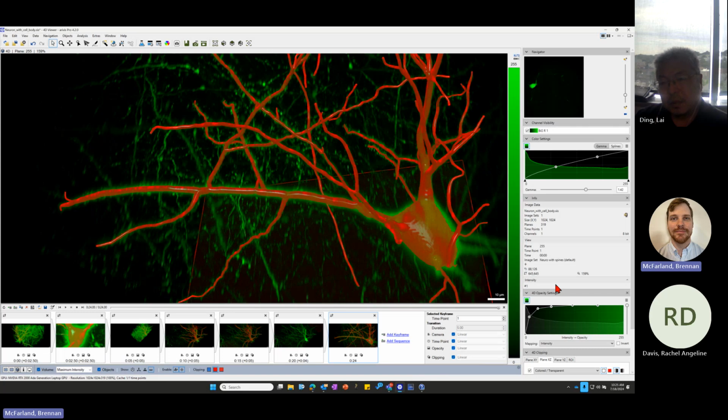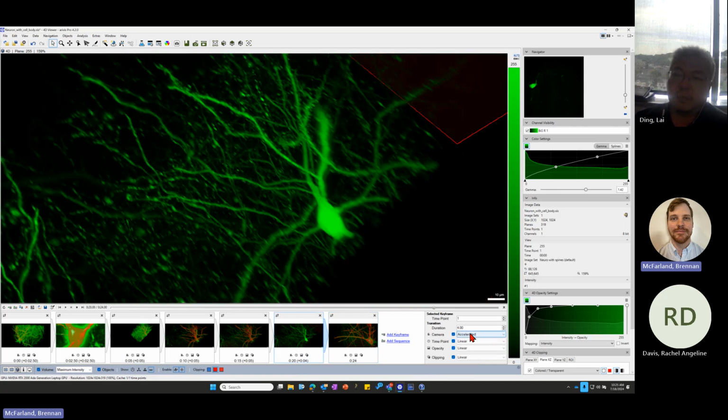It's still going to move through that. The sequence is the same. It's just how fast you want to move through the sequences at different parts of it. So even though the whole frame is going to be 4 seconds, it's just saying, where do you want to emphasize the transition? Do you want to accelerate it at some point in this 4 seconds, decelerate at some point, do both, or just hold it linear throughout the 4 seconds?